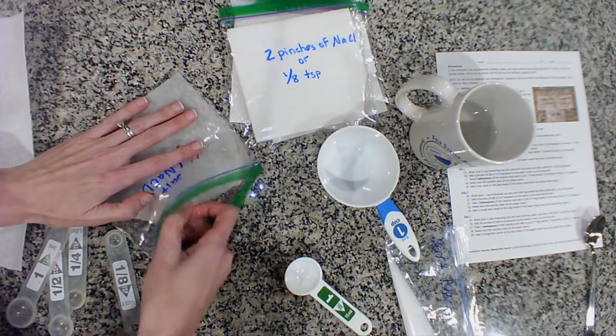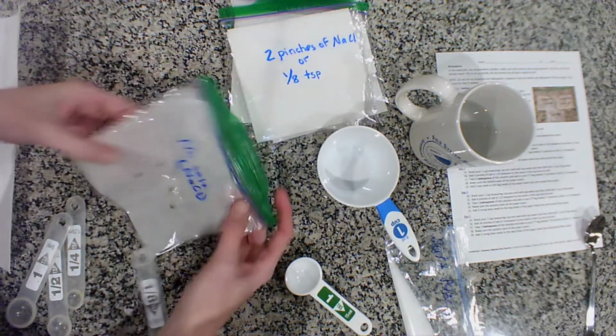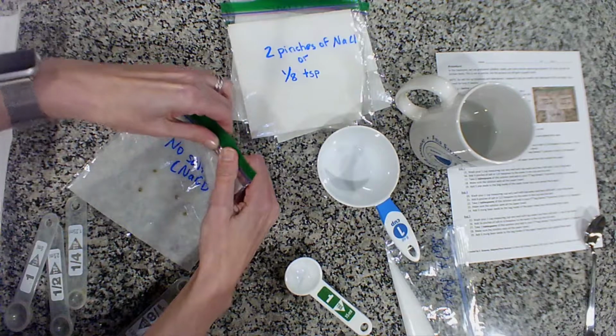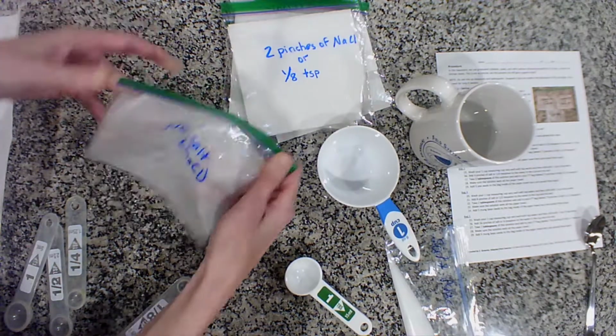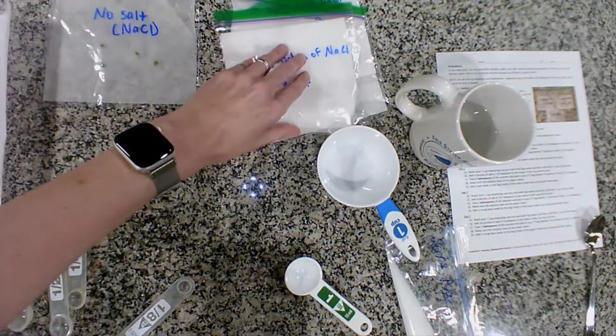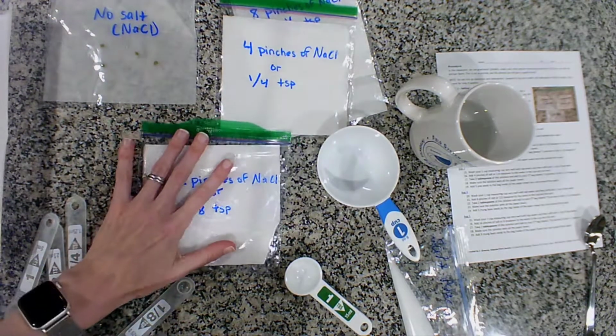All right, be careful with these paper towels. They're pretty fragile. Make sure you squeeze all the air out of it and then go ahead and seal it. So that would be no salt. Okay, so that one's already done. Now it's time to move on to our 2 pinches of NaCl.